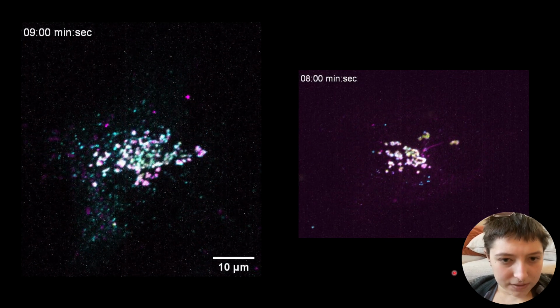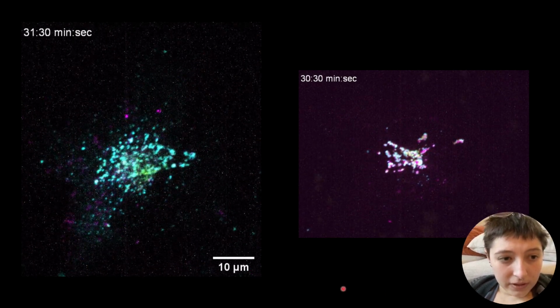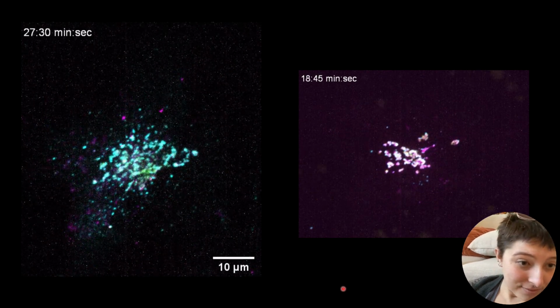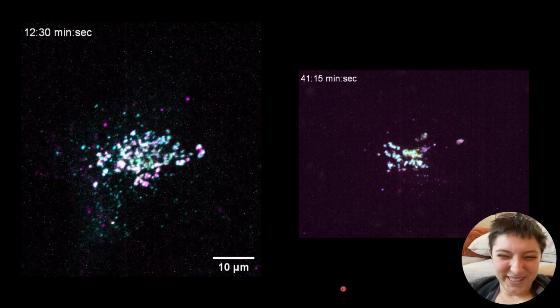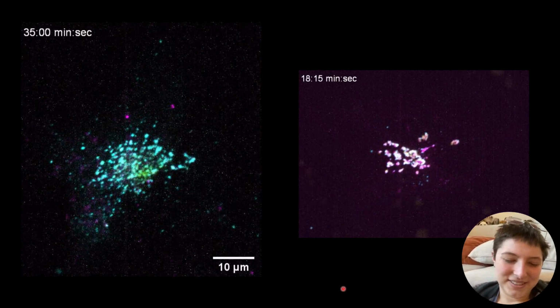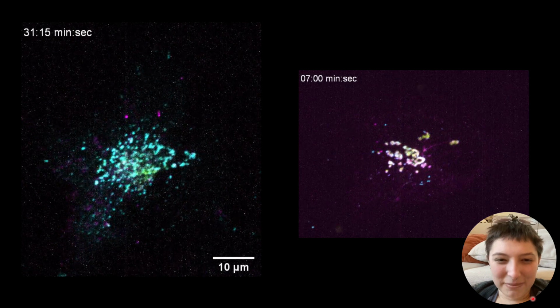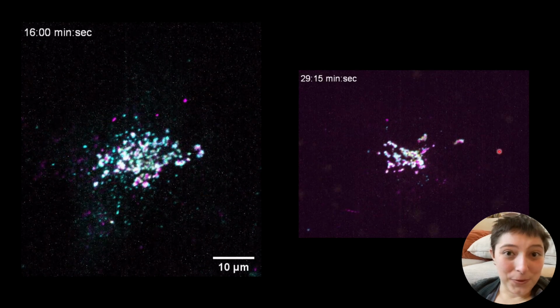So in these movies, we have the ER exit sites also labeled. Just more videos where it worked. And yeah, I think they're just pretty to watch. I don't know how much you can really get from it. Again, this is purely to get a baseline for future analysis. And so there's not much else to be said about it, but I still think it's cool.